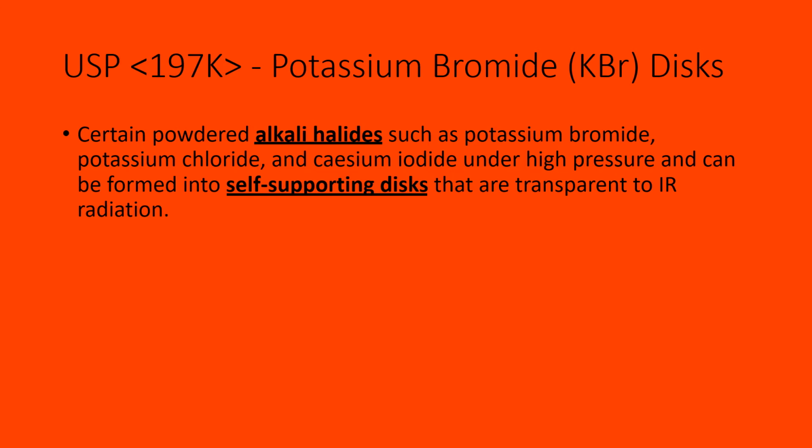The disc transmission must be at least 60% for a good scan. If the disc is clear, you are sure to get more than 60%. For an opaque disc, you get a very poor scan. You have to remember this.